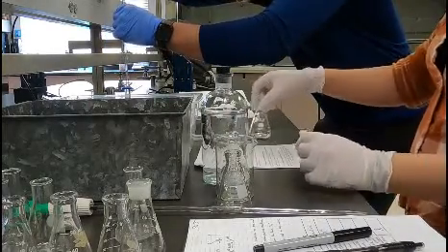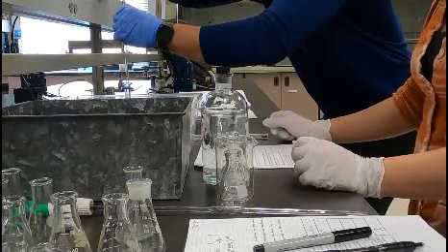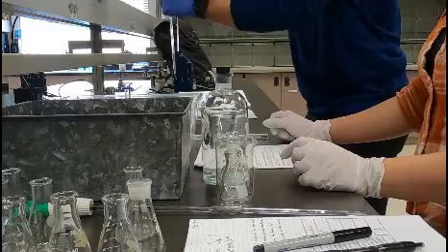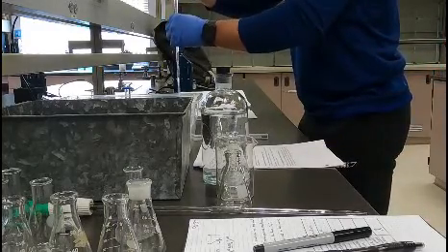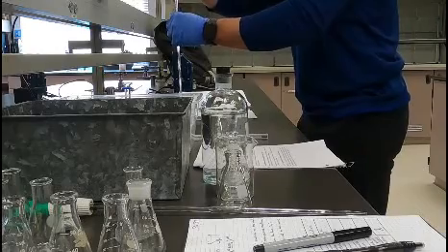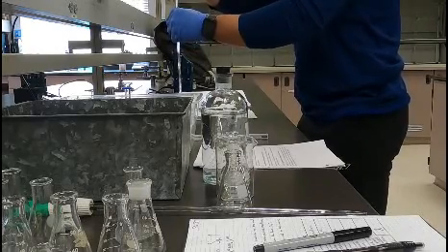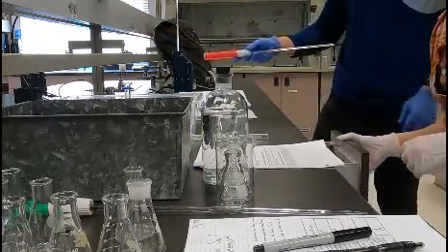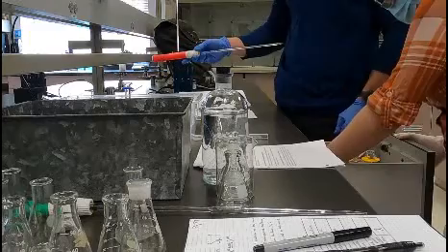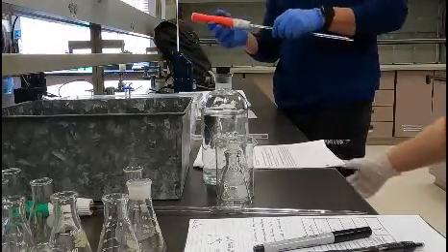He's pipetting the base. Do you want me to get the water? And then you need the indicator, right? Bromophenol blue, right? Let me bring it in with the Erlenmeyer flasks — I think I gave them all enough.